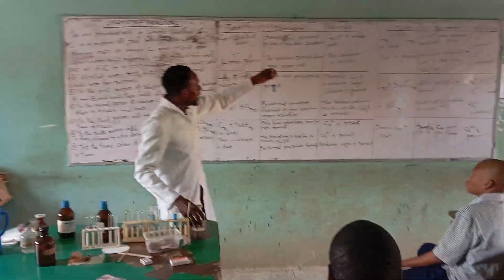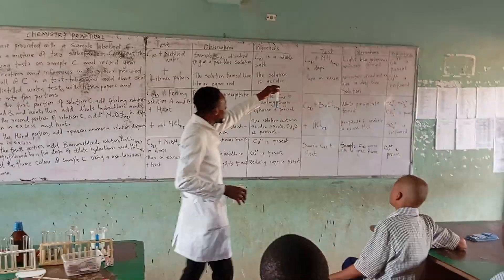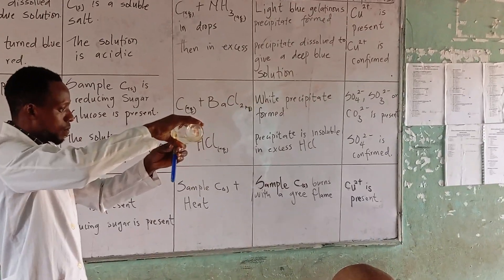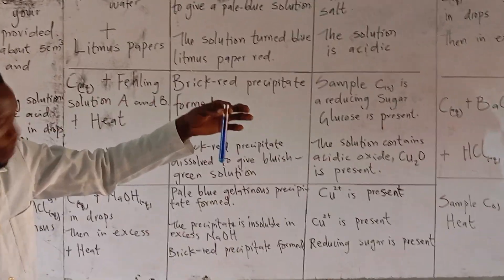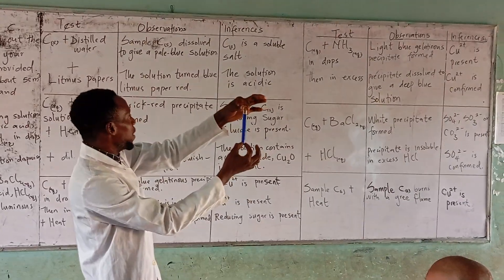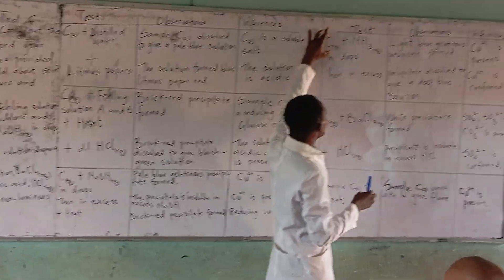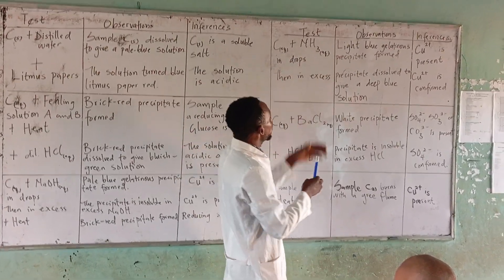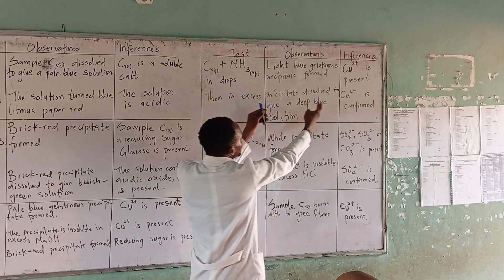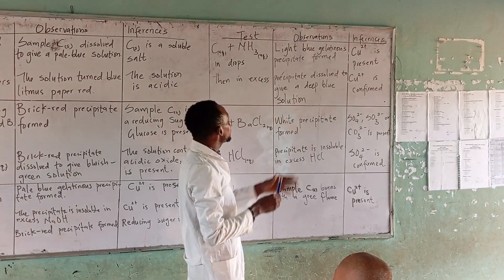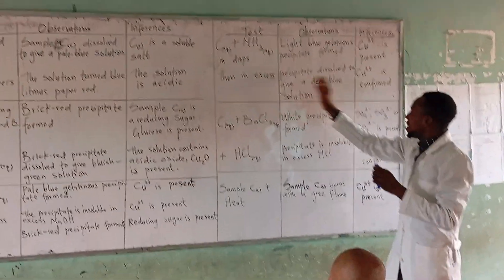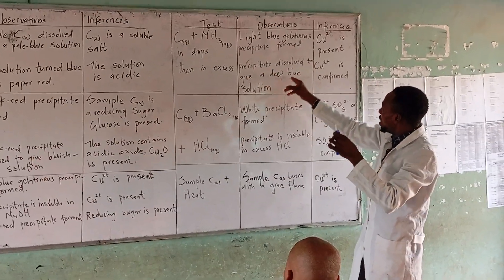This is aqueous ammonia. We have added aqueous ammonia in drops and we can get a light blue gelatinous precipitate. Now let's put it in excess and see what we get. In excess, the precipitate has dissolved to give a deep blue solution — this is deep blue, not light blue. So you record: aqueous solution of sample C plus aqueous ammonia in drops → light blue or pale blue gelatinous precipitate formed. Then in excess: the precipitate dissolved to give a deep blue solution.